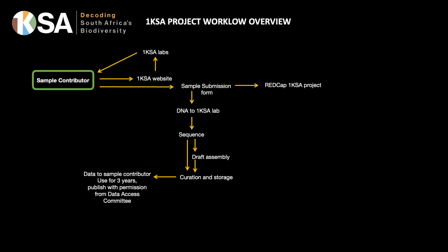Through DARISA, the data is then made available to the sample contributor, and the sample contributor can use this data automatically for 3 years. However, we do request that permission is obtained from the Data Access Committee before publication, and I'll talk a little bit more about that in a few clicks. During the sequencing and the draft genome assembly steps, a number of different metrics are recorded, and these are also uploaded onto the REDCap project database.